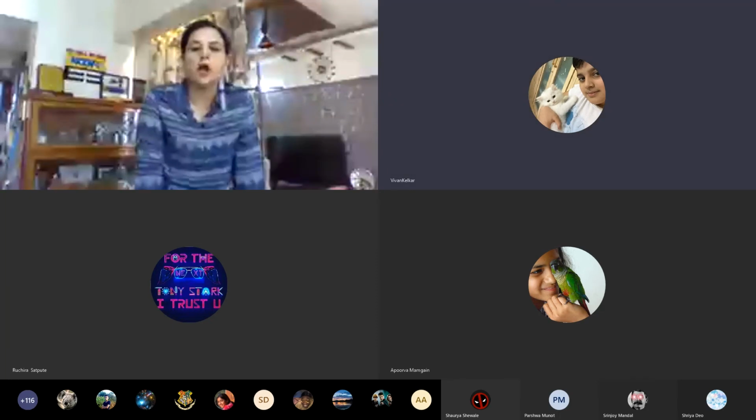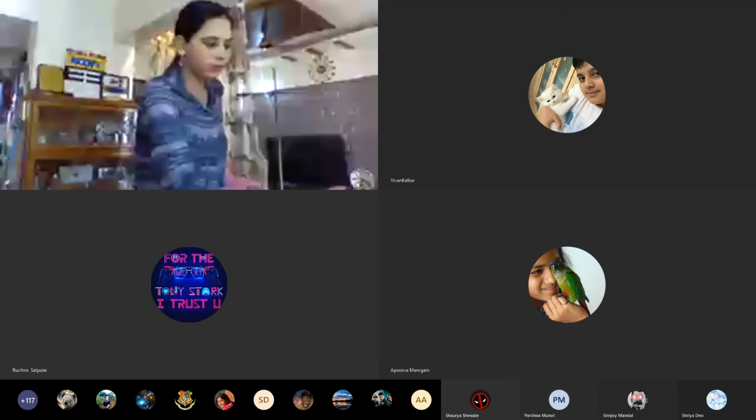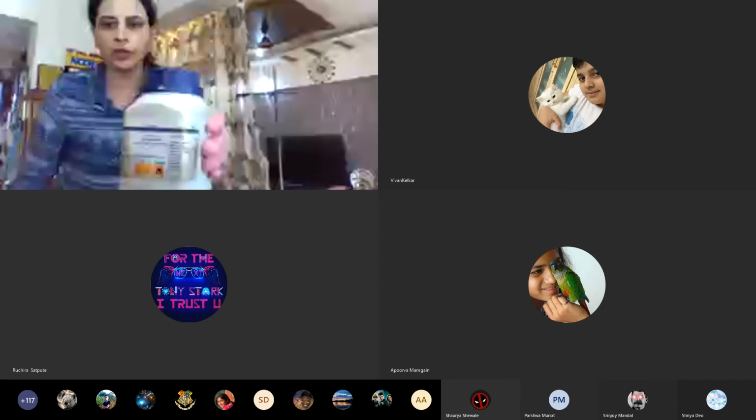Okay. So now first we'll see reaction of sodium with oxygen. So children, let me show you what all materials are required. Can you write down the materials required? So we need sodium metal.